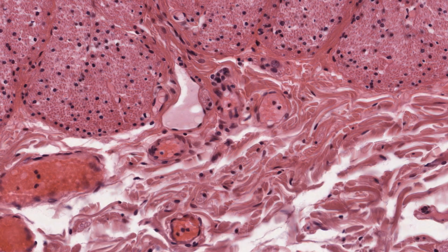Acidophilia, or as I said earlier, when we use eosin, it's sometimes referred to as eosinophilia, can be demonstrated in a number of different tissues. For instance, in the upper half of this image are smooth muscle cells. Acidophilia, or eosinophilia, is exhibited by the contractile filaments or contractile proteins inside these muscle cells. So you would expect cytoplasmic filaments in skeletal muscle fibres and cardiac muscle fibres or cardiomyocytes to also exhibit acidophilia.